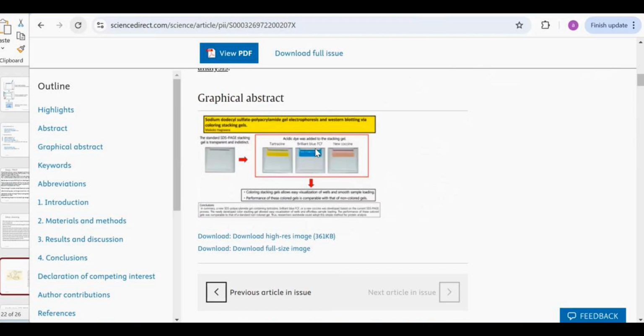We will discuss it in the next lecture, that is how to study the chromatogram, right? But when it comes to applications, for the purity of protein you will see a single band that is formed, right?